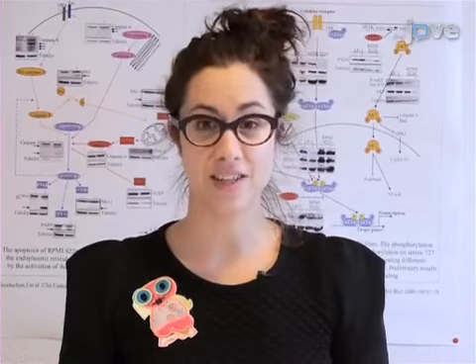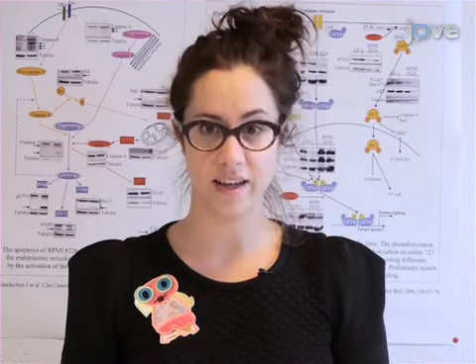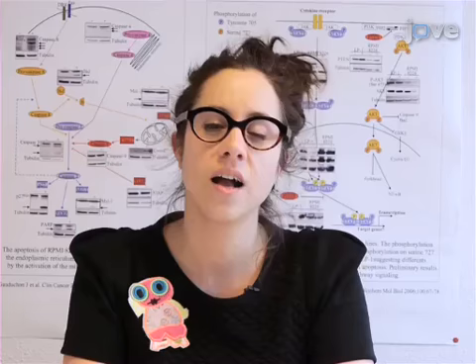The main advantage of this technique over existing methods, like the β-galactosidase assay, is that it facilitates rapid and sensitive quantification of senescent cells. In fact, we first had the idea for these methods when we experienced difficulty with quantifying senescent cells using the commonly used β-galactosidase assay.